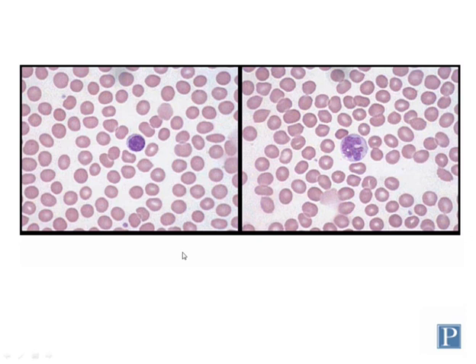Here is a composite image showing a lymphocyte on the left, and here's a different monocyte. This one has a little bit of the U-shape or horseshoe-shaped nucleus, but it's kind of irregular shaped as well. So again, there's some variability in what those cells can look like. Make sure that you are able to identify and distinguish between all 5 types of leukocytes as I've shown you in this PowerPoint.